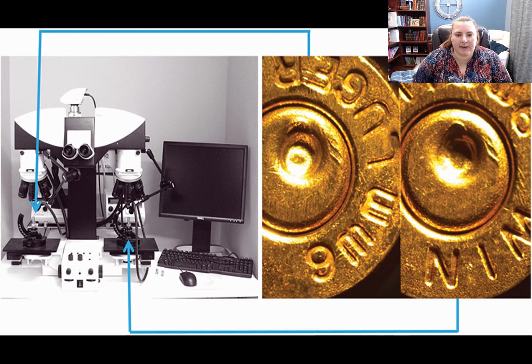The comparison microscope is another type of microscope that's used in forensic analysis. We've talked previously about how a comparison microscope is used to compare unknown and known samples. Here you can see an example of how the ballistic comparisons we've discussed previously are obtained using a comparison microscope.